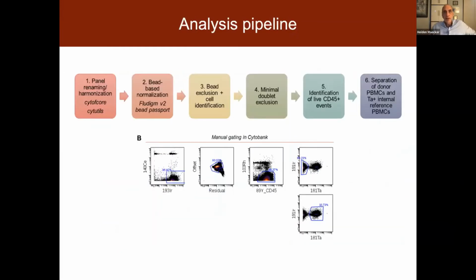This is then the analysis pipeline that was run. This was also led by Mount Sinai, and it's rather similar to what is done by the Astrolabe system, which we are using as a kind of standard method for doing gating and analysis of CyTOF data in the network. This is just one that was really created by Adib, and so it's doing a similar thing, but it's a sort of homegrown pipeline.